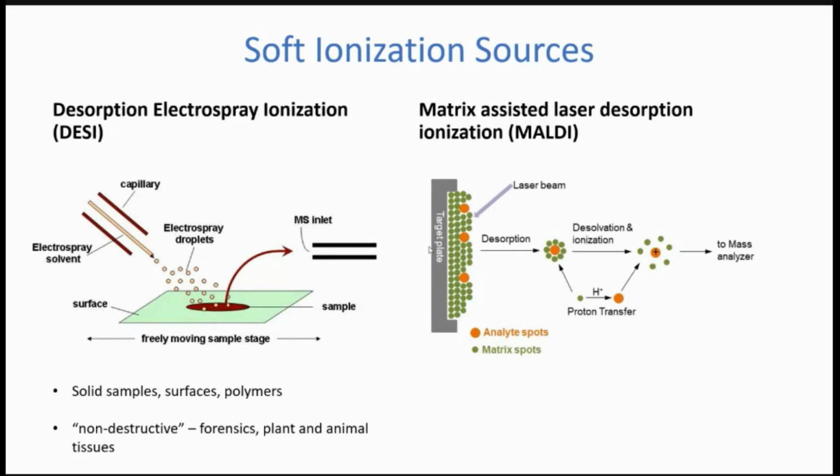Oh, Simon. Okay, it's possible. Simon says that he thinks that they might have been using DESI at airports for detection of explosives and things like that. And I think you might be right. I can't remember what they used there.